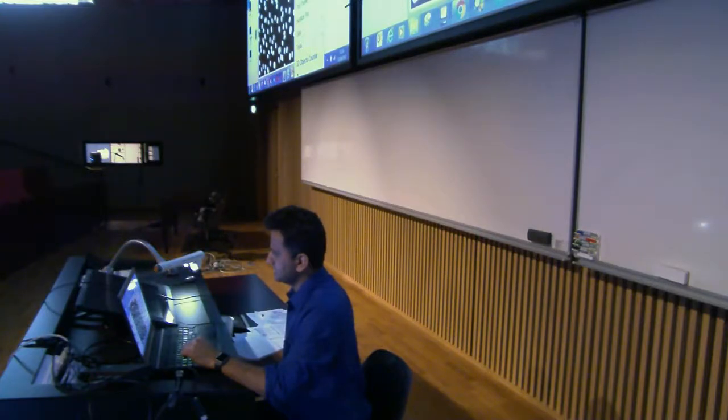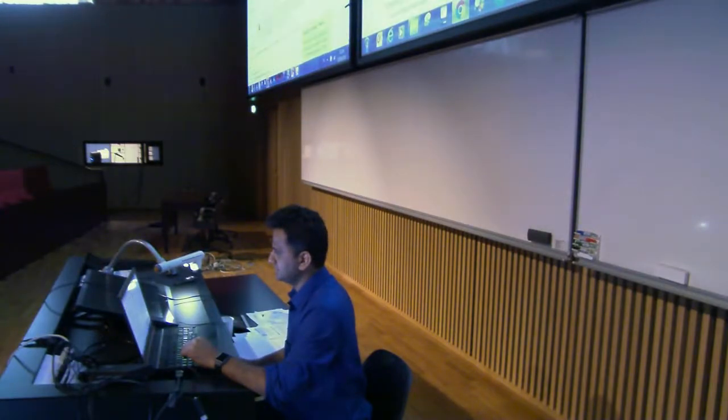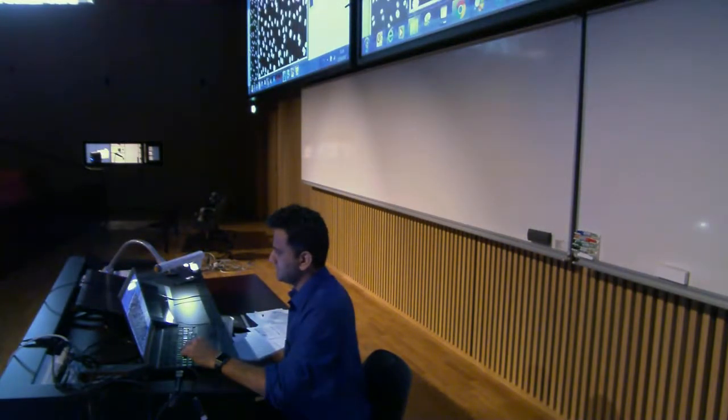And then you just go here, analyze. Before that, you have to open your raw data. So just go and, what was my nuclei? Just open my nuclei here. So you see the difference between the raw data and my mask. Okay, so I'm allowed to do whatever I want to do here. That's fine. Then I go to analyze particle.